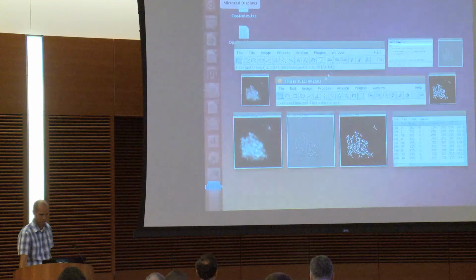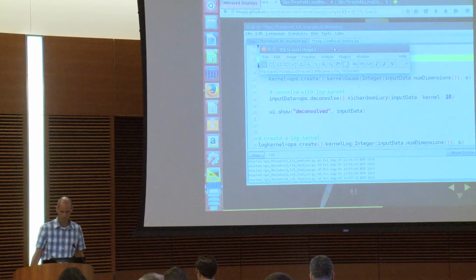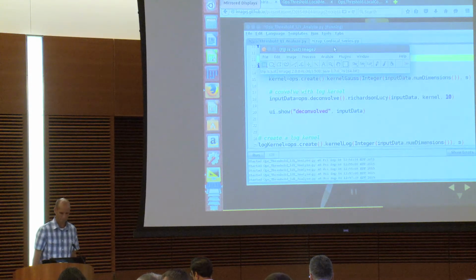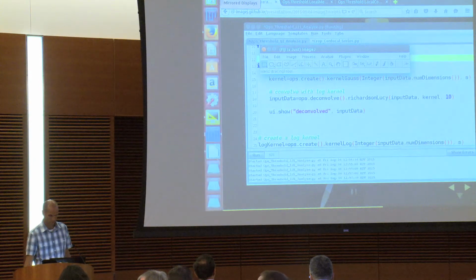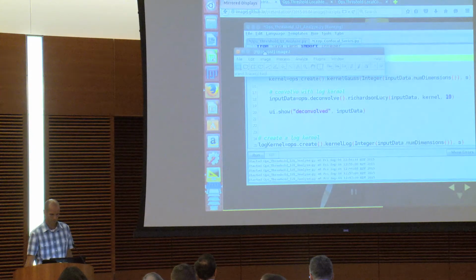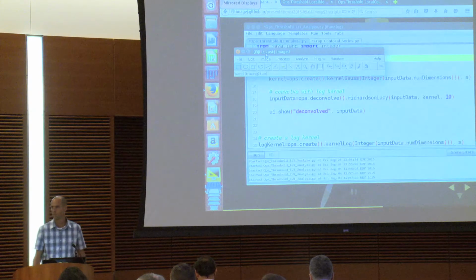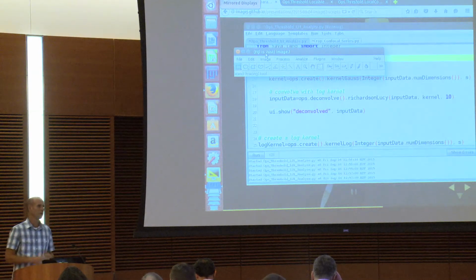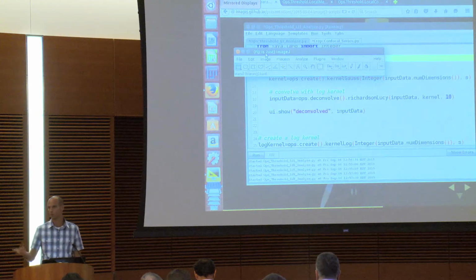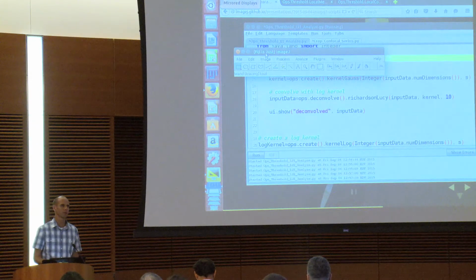To be clear, by default, ops thresholding works across your entire ND data set. If you have a 4D data set and you say, I want to take an Otsu threshold, it looks at all pixels across all time and all channels, makes a histogram of that, and does it on that. The common case is to threshold each plane, and that's one of the things this can do. Ops is powerful, but if you're not careful, it can give you unexpected results like that. It wouldn't really make sense in a lot of cases to calculate a threshold between channels using the data from both channels.